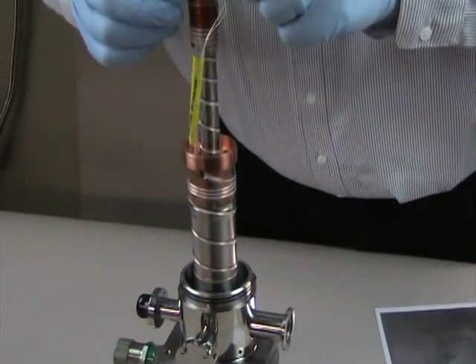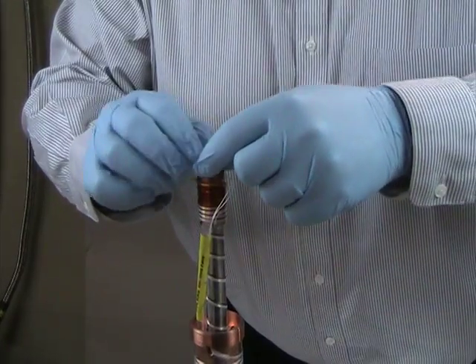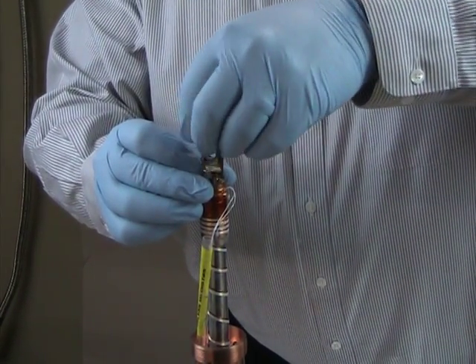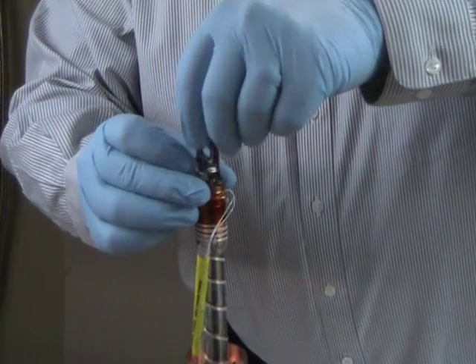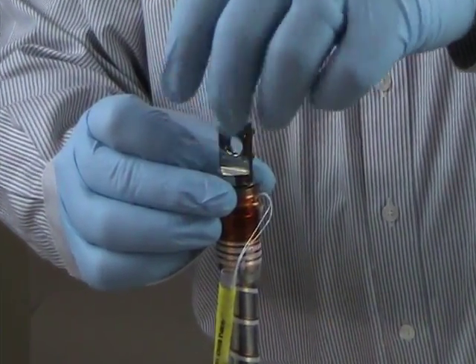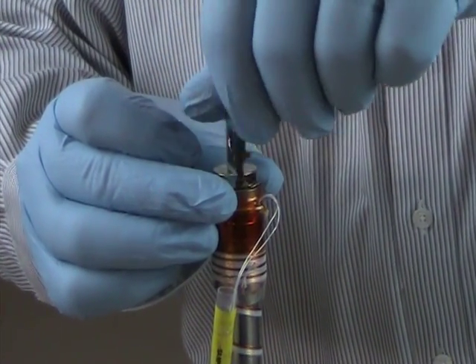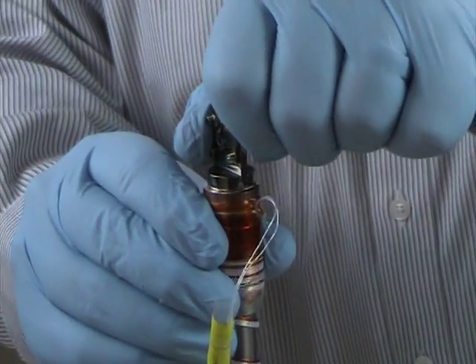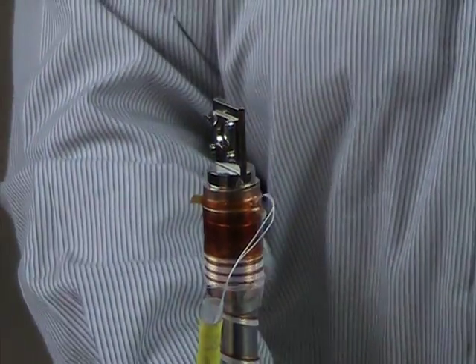Lay the gasket across the cold finger and screw on your sample holder. Turn it nice and tight.